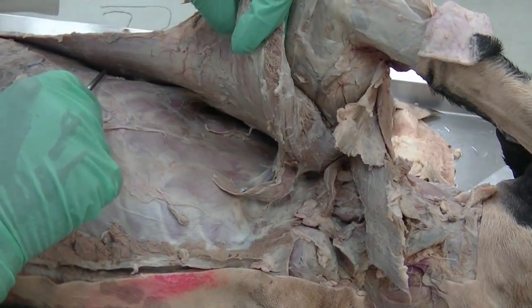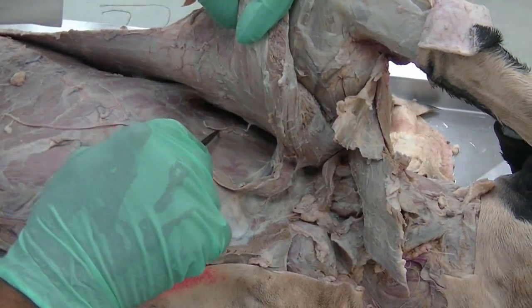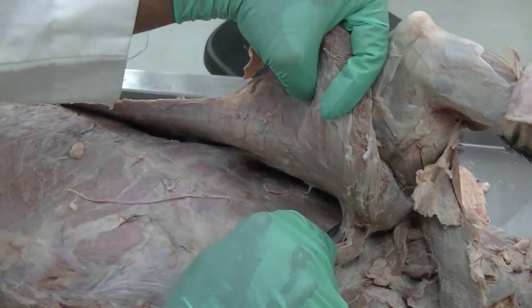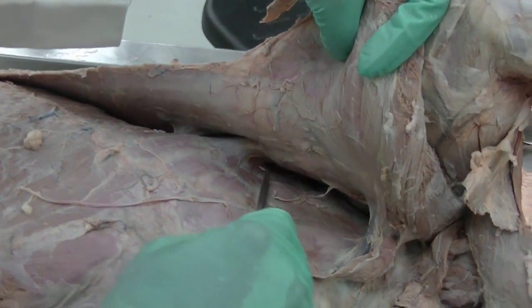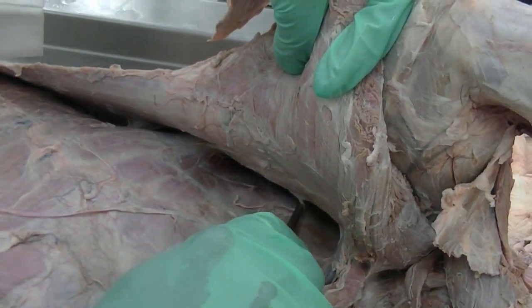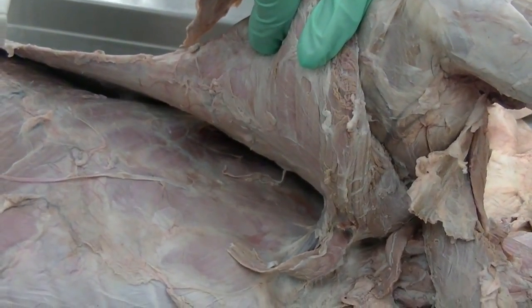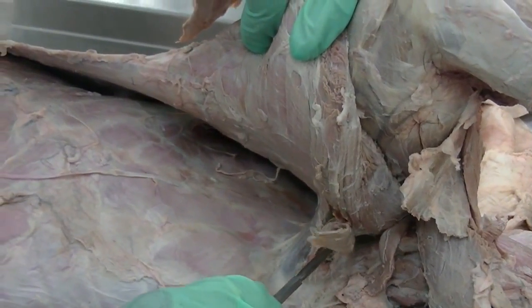The part of the muscle which is present on the thorax is called serratus ventralis thoracis, and the part present on the neck, specifically on the cervical vertebrae, is the serratus ventralis cervicis or cervicalis. So this is your serratus ventralis muscle. After transecting the serratus ventralis muscle and the rest of the extrinsic muscles, we should be able to take the forelimb completely off the body after we cut the blood vessels and nerves which are going towards the forelimb.